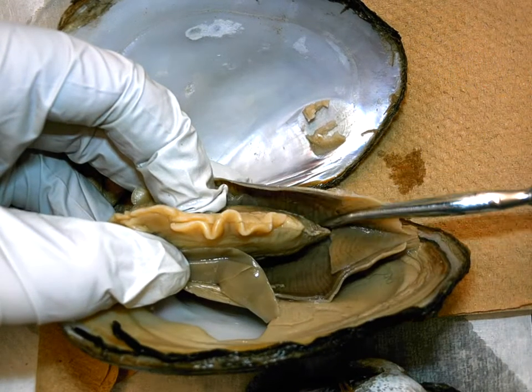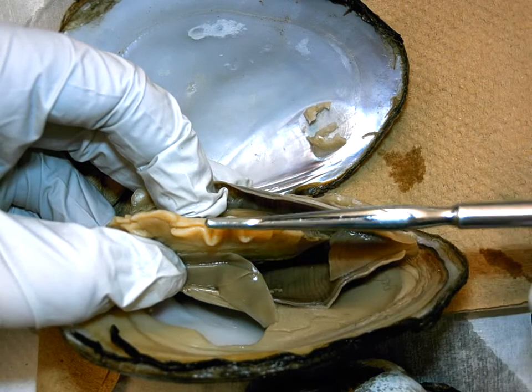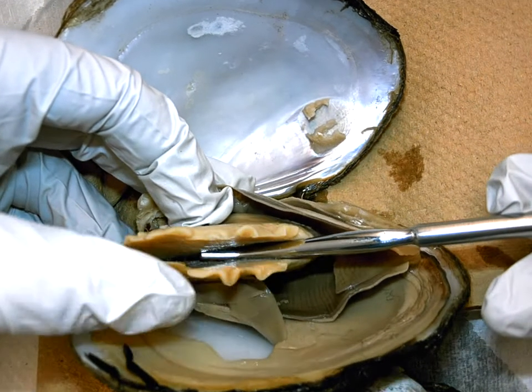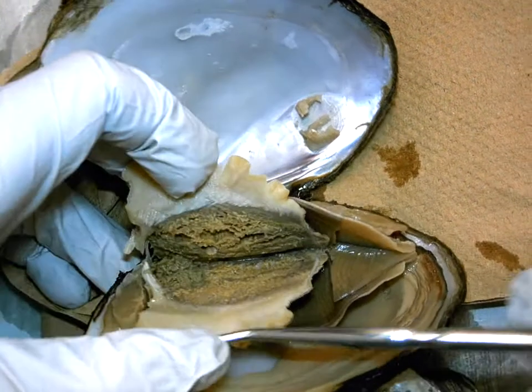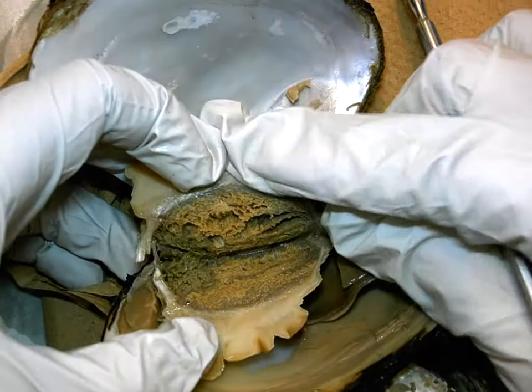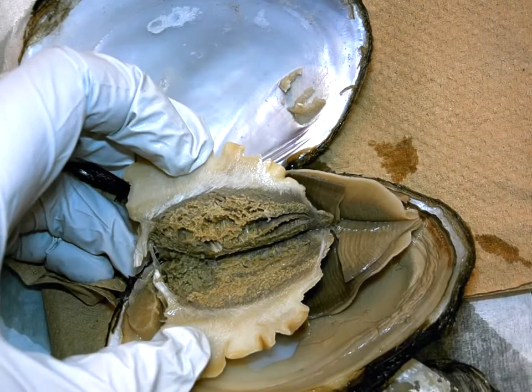very nice incision going from anterior to posterior, cutting from the ventral side deeper and deeper towards the dorsal side of the animal. What that allowed us to do is fillet open this area. Now once we fillet it open, it becomes very obvious where the foot ends and the visceral mass begins.